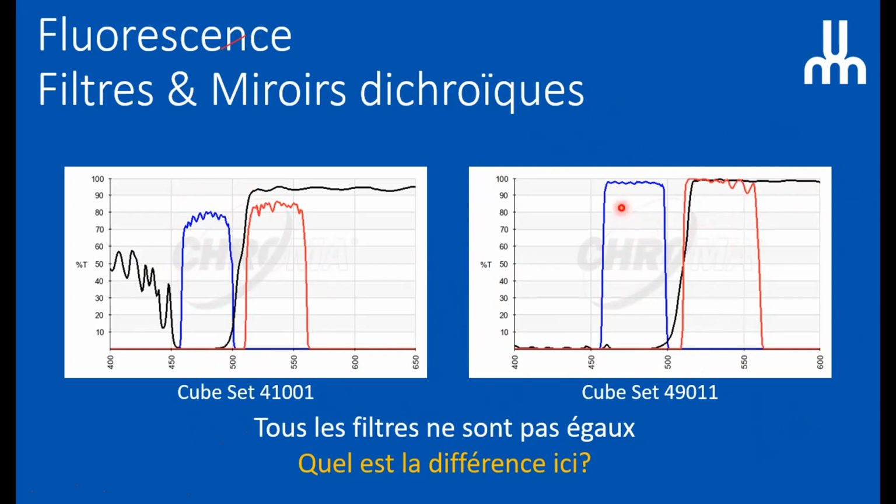Yeah, there are basically two kinds of filters: soft-coated and hard-coated. The technology is different. The hard-coated can live very, very long. The soft-coated just have a layer on the top, so they go bad very quickly. But this is more of my job at the microscope, to choose the right filters and make sure they last long and are the best for the application.